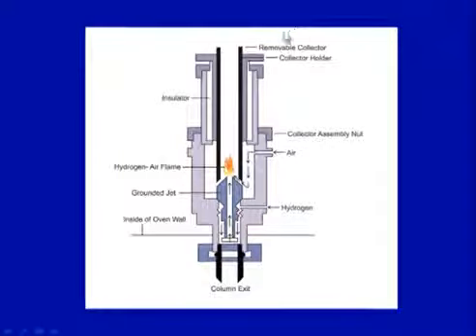So, this is a very useful and most widely used detector, and like I said, it has a certain limitation: oxidized carbons cannot be sensed here. Other groups like hydroxyl will have lower detection limits, and it is directly proportional to the CH2 groups. It is very useful for environmental samples, in pollution studies, and a lot of other studies.